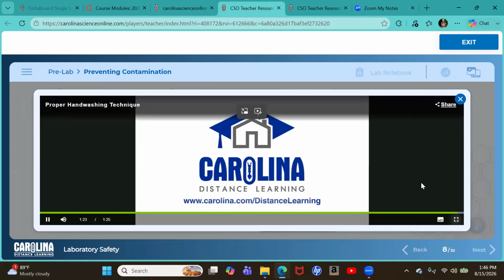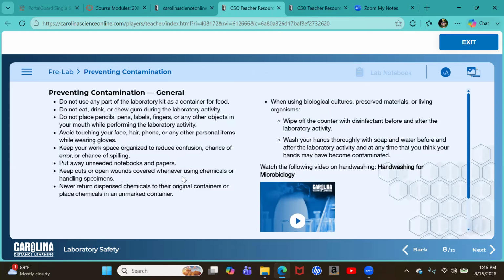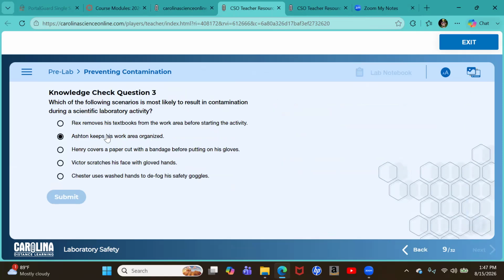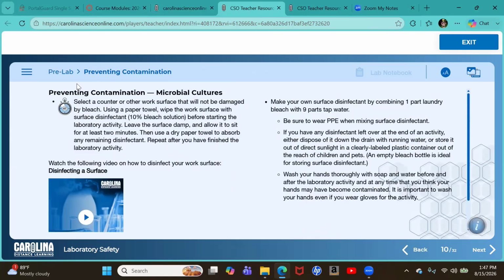Okay. Hand washing: before you put on gloves, after you take off gloves, anytime your gloves become damaged, remove them and wash your hands. Wash your hands, wash your hands. All right. So, one of these pre-lab check questions: which of the following scenarios is most likely to result in contamination during the activity? When you read through each one, you see, ooh, Victor is scratching his face with gloved hands. That's a no-no. He might have chemicals on his gloves that would get into his eyes or his nose.